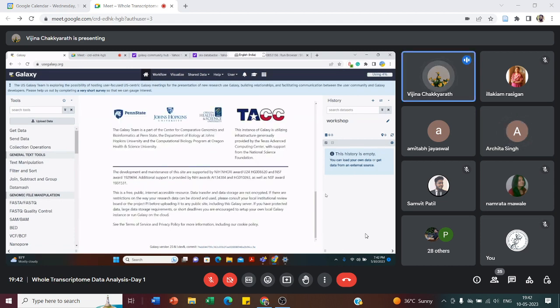Oh, maybe you downloaded two times. I couldn't download my data. I think the network here is very slow. Maybe because of my problem or server problem.